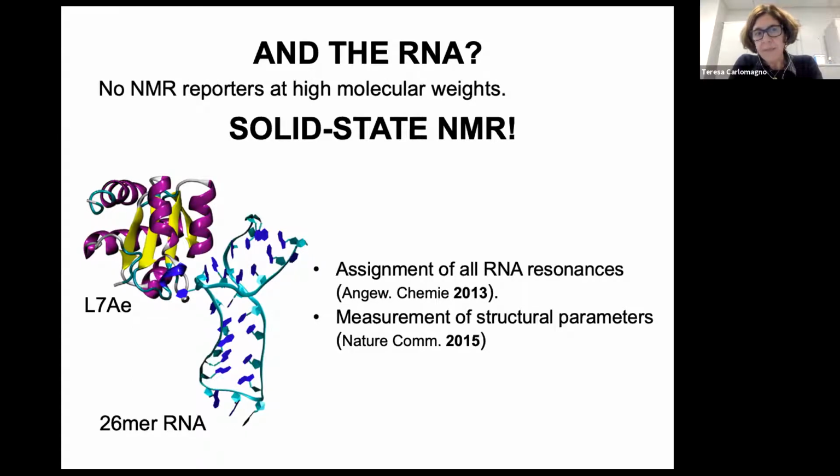So for this study, in order to obtain an RNA with a certain well-defined structure, we decided to use this RNA in complex with a protein. And so what we have in the rotor is not a crystal. This complex actually doesn't crystallize. And if you look at the precipitate that we obtain in the microscope, you would see maybe a hint of some well-defined sides of these precipitates, but actually nothing that to a crystallographer would look like a crystal.